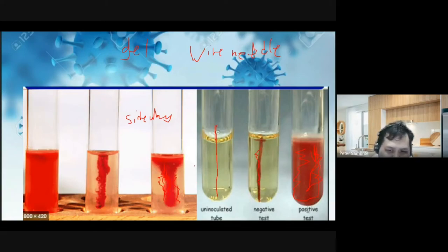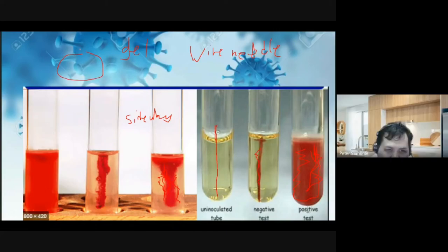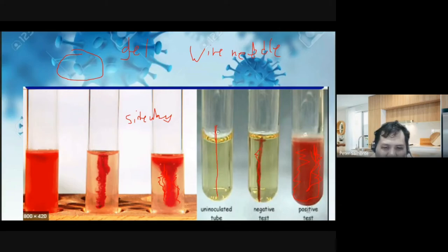Yes, Edward. So that kung magpara maaman akong positive, so dapat ang below na test tube ang ma-change color, hindi pwede ang patas sa left side. Oo, kasi nag-change color yan depending sa may indicator. Kasi yung SIM nyo class, your SIM has an indicator. So yung indicator class would cause your bacteria to be colored. I forgot to mention the indicator. So your bacteria would tend to be red. Red lang ang color niya, Edward. Okay. And I hope that answers your question. Yes, sir. Thank you. Okay.